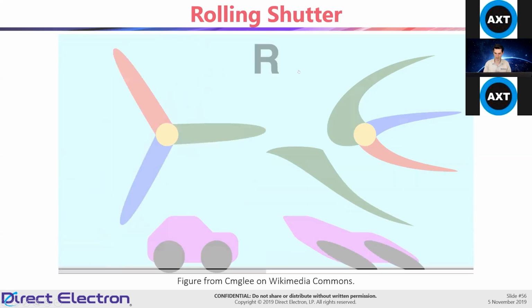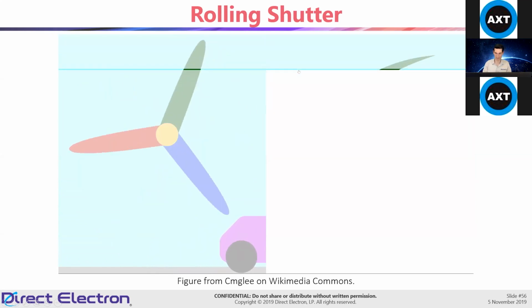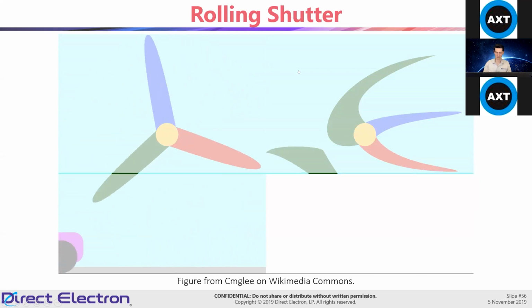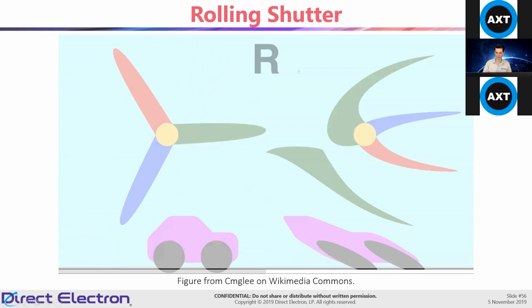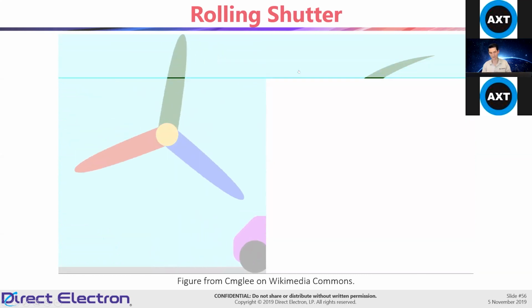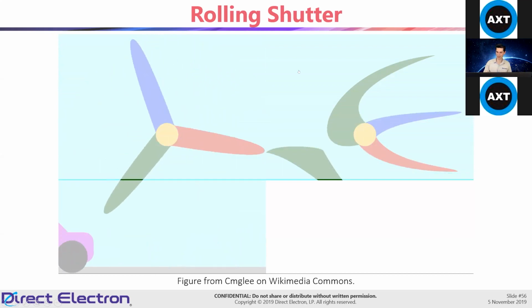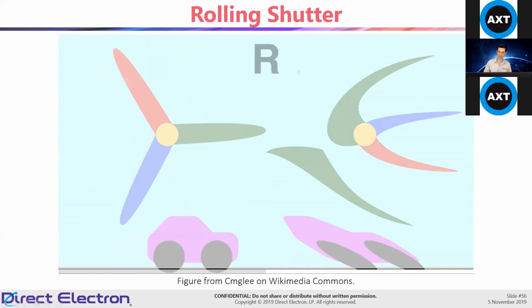For something like material science, we're talking about 4D STEM. Basically, you can think of it as that as you're scanning across an object or your sample, then every single spot is a diffraction pattern, and only one diffraction pattern if you have global shutter. And so this is, again, part of the hardware approach that we've taken to minimize noise and maximize flexibility.